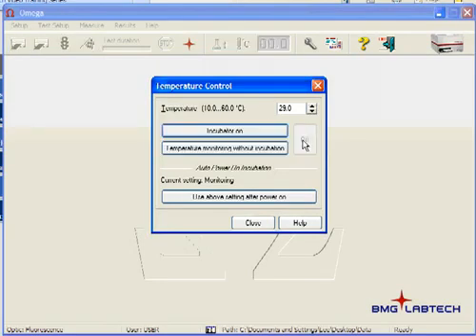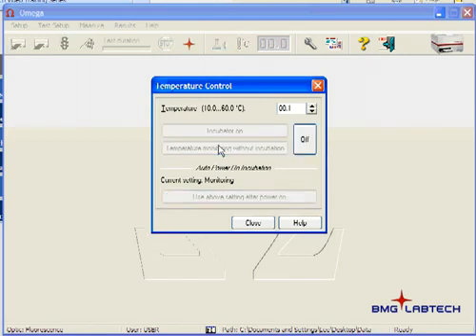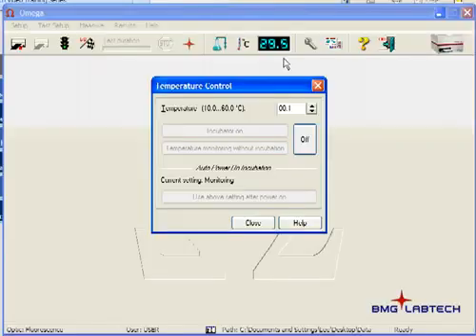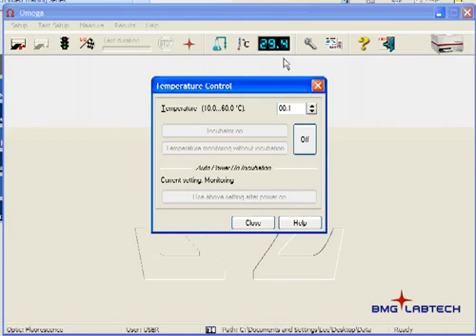If you'd like to simply monitor the temperature inside the laboratory, inside the instrument, then you can click on temperature monitoring. The temperature monitoring button will tell you exactly what temperature is inside the reader at the point of whatever temperature is in the lab. This is typically two to three to four Celsius higher than ambient room temperature.